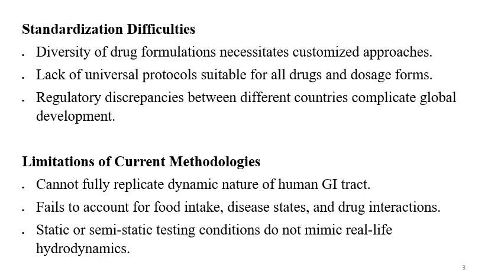Then there are standardization difficulties. Diversity in drug formulation necessitates customized approaches. There is a lack of universal protocols suitable for all drugs and dosage forms. Regulatory discrepancies between different countries complicate global development. So there are difficulties in standardization, difficulties in the global requirement, and difficulties because of the nature of the drug molecule and the nature of the formulations.